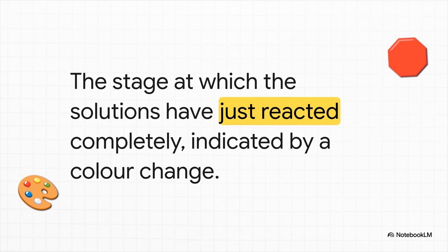It's the visual cue that tells us we've added just enough of our standard solution to react with all of the unknown substance in the flask. Not a drop more, not a drop less. That is our moment of truth.